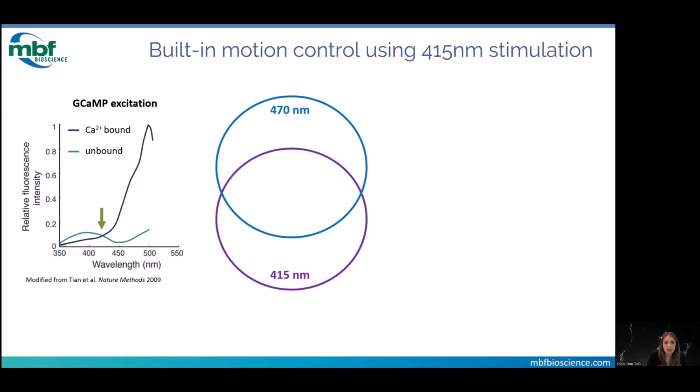The way that we think of this is that if you have motion artifacts in your signal, or you have a decay shape from bleaching of autofluorescence in the tissue or the patch cord, or you have some kind of artifact from the patch cord bending, that's going to show up in both the 470 and 415 signals. However, theoretically, most of your neural activity is going to be captured exclusively with your 470 channel. And so what we can do is then remove the 415 contribution to the signal. What that allows us to do, putatively, is isolate our calcium dependent signal.